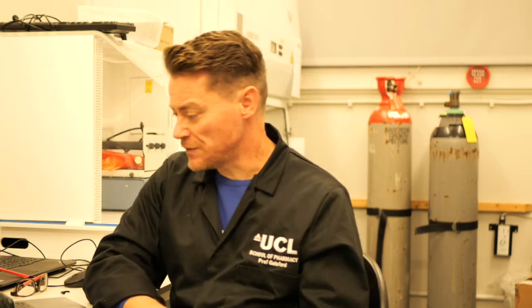You can usually tell an SEM image because it's grayscale, and you can usually tell whether the material is crystalline or amorphous, as I said already, by looking for sharp edges or smooth surfaces. Typically we would use SEM for spray dried powders or milled powders, and again we're looking for particle size, smoothness, regularity, that sort of thing.